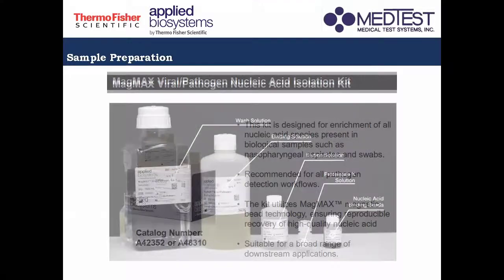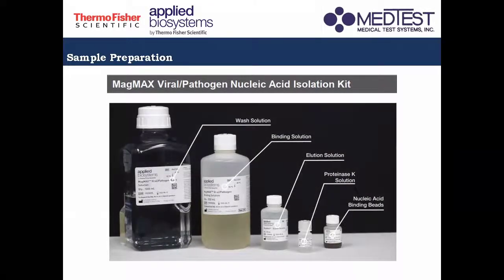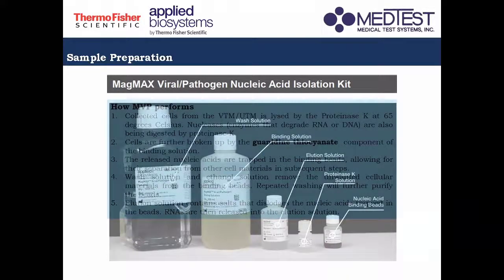So, yung contents or yung components po ng MagMax natin ay nandito, shown. So, meron po tayong wash solution, meron tayong binding solution. This is used in conjunction with the nucleic acid binding beads. And then we have the proteinase K solution, and then the elution solution. So I will discuss this in the preceding slides.